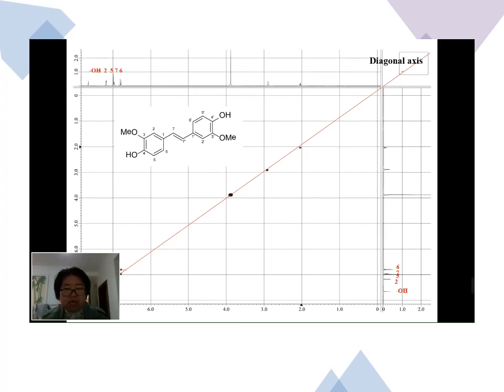Off-diagonal peaks indicate coupling between the two protons. The way to analyze a COSY spectrum with many unassigned protons is to make a table of correlations like the one seen here. In this structure, all assigned protons show the COSY correlation.